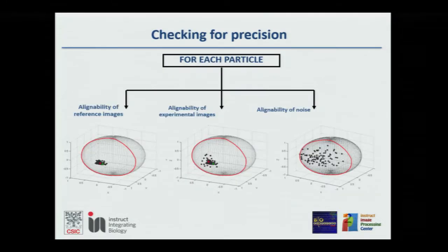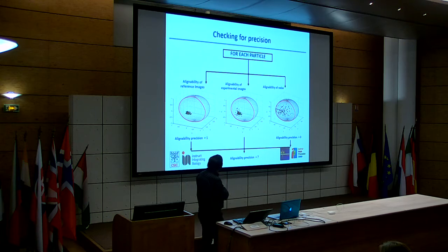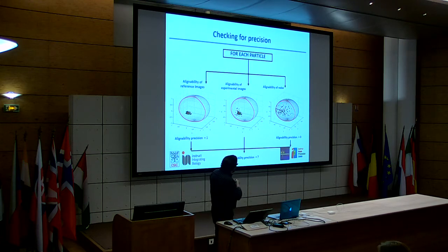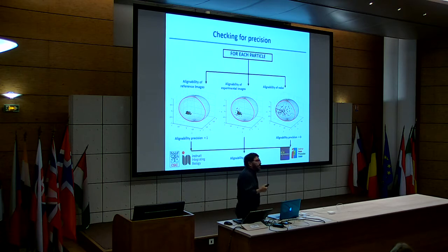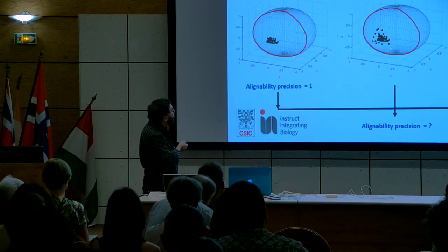We eventually solved that problem, and we were able to present a situation in which we could say, listen, this is your ideal situation in which we have properly taken into account the information capacity of each image. This we assign the number 1. This is actually the situation of pure noise. I have predicted your orientation, and instead of giving any good prediction, I have just put together a set of noise. This is 0, and this is actually where you are.